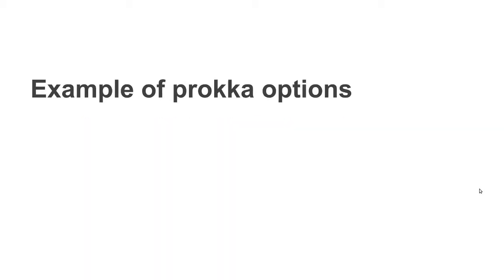For this tutorial, these are the options we are going to use. The first option is prefix. This enables you to give a name. I call it the base name. This is a name that will be given to all the files generated, in addition to their respective file extensions. You could also use the outdir option in place of the prefix. The outdir enables you to specify a directory where Prokka will save all the files generated.